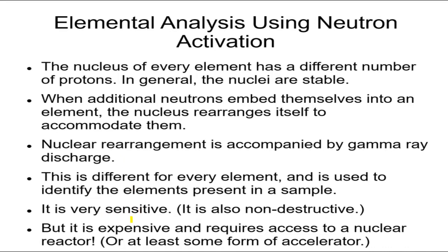Two things about it: it's very sensitive, very precise. You can certainly identify them very easily this way. Also, it's non-destructive because neutrons don't do much to the sample. So it's a very useful way to do it.